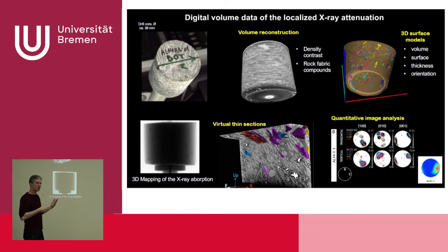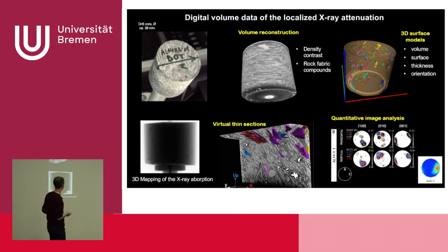So when we have our digital image volumes, I can here present a drill core. If we scan it, it looks like this. Some dark minerals, very heavy in X-ray absorption. And now we have different representations of this volume image data set.